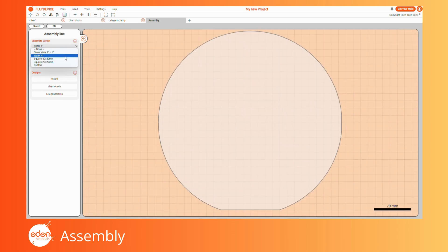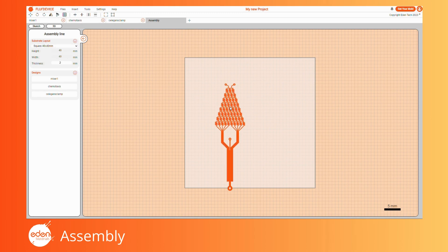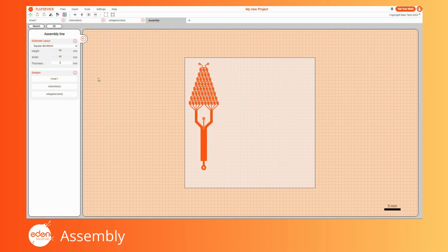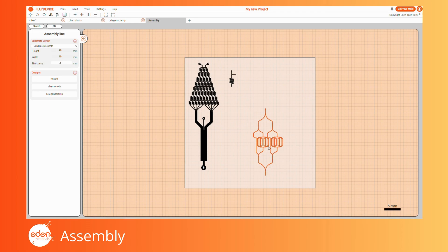A white layout of the substrate is visible on the grid to help you place your designs. Below the Substrate Layout sub-menu, you can find a list of designs corresponding to each of your sketches. To add a design to the Assembly grid, simply drag the desired element and drop it on the grid. The created design's dimensions cannot be edited, but most operations — drag, rotation, mirror, copy-paste, align, and distribute — are available.